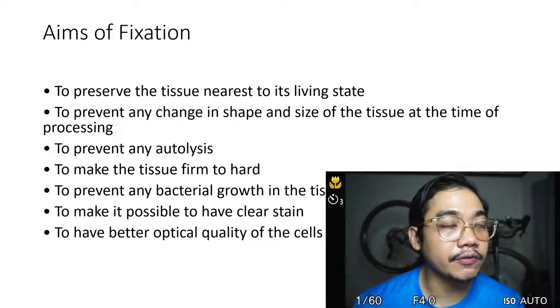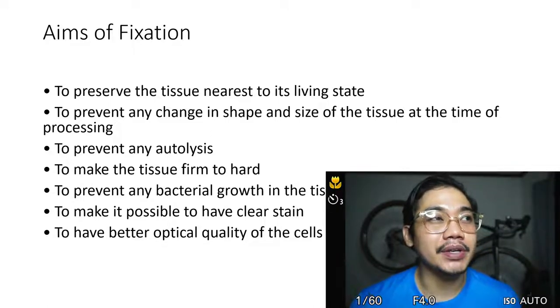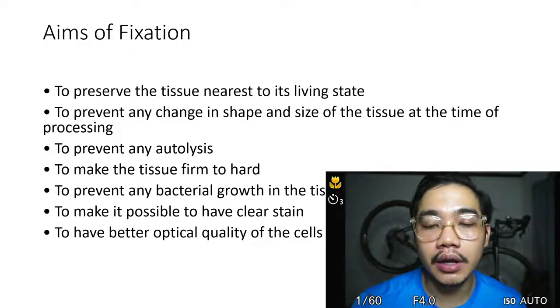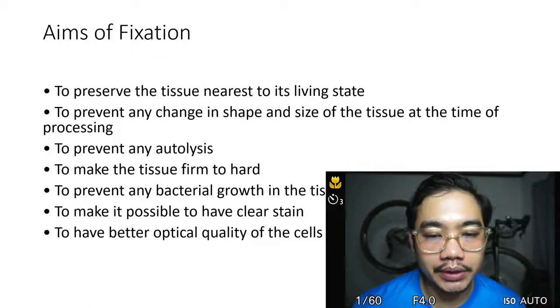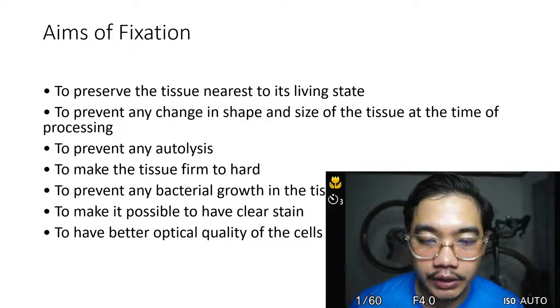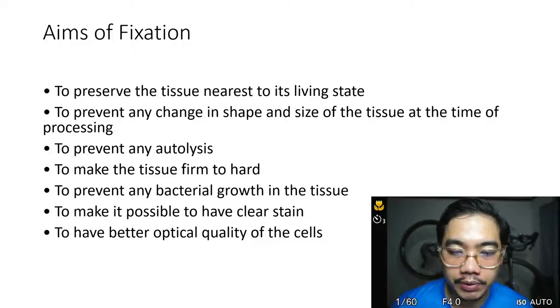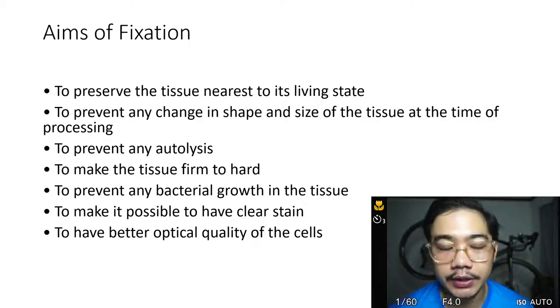It's very hard to cut tissues when they're still very soft. We can't get an adequate slide if it's still soft. Fixation also prevents any bacterial growth in the tissue, like I said earlier, to prevent putrefaction. And then it makes it possible to have a clear stain, to have better optical quality of the cells.